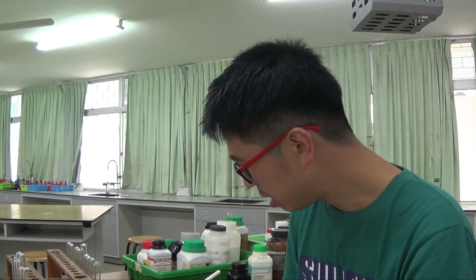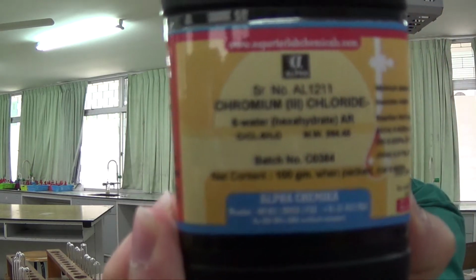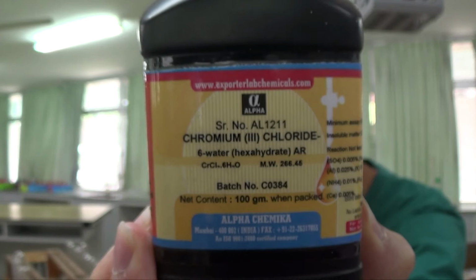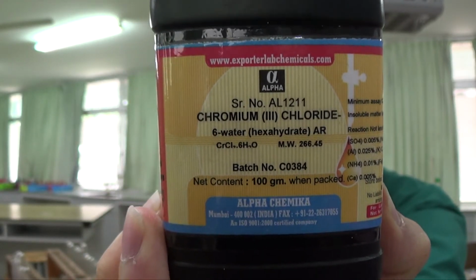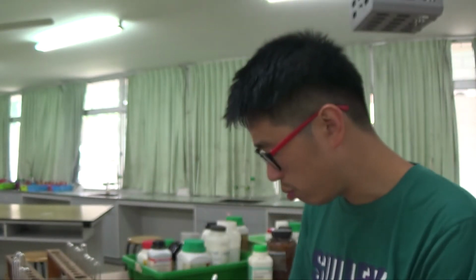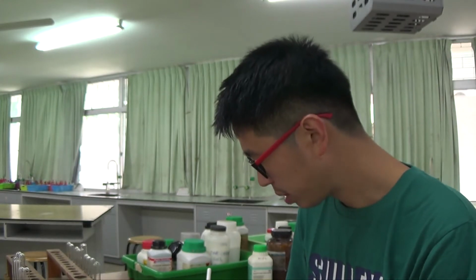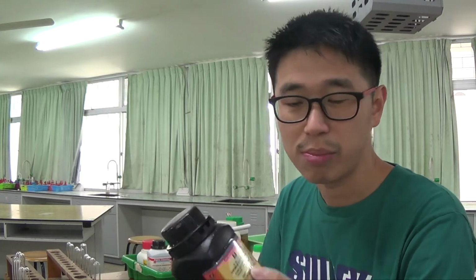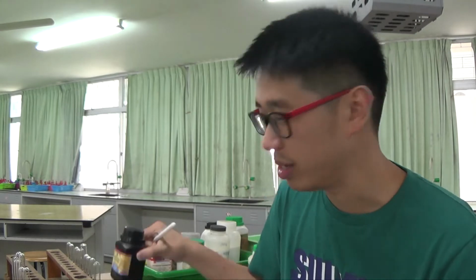The other cation that we'll be talking about is chromium trichloride. This is a hexahydrate. I talked about water of crystallization, and this was one of the compounds featured. So here we will be using chromium trichloride hexahydrate. It doesn't matter whether it's hydrated or not, because if you are provided with the solution in the exam, it does not matter whether it is hydrated or not, because it will have been dissolved in distilled water anyway.